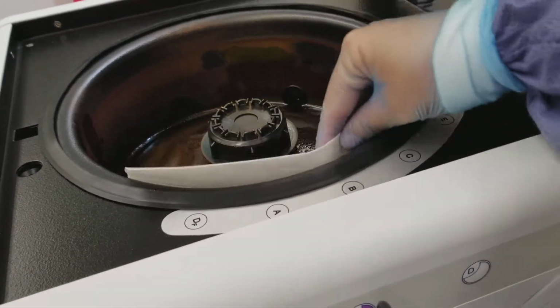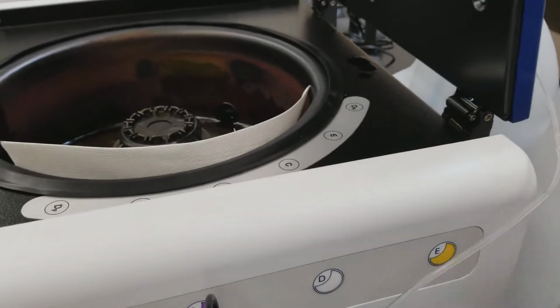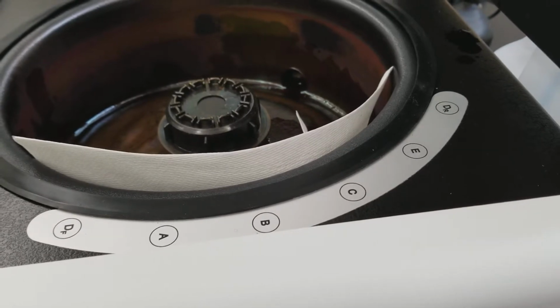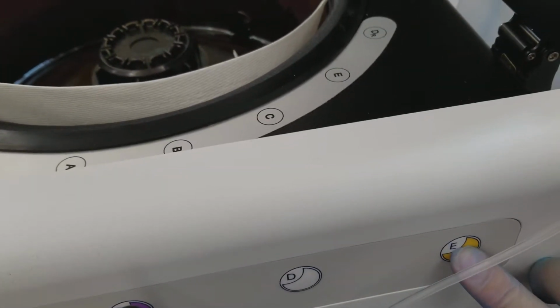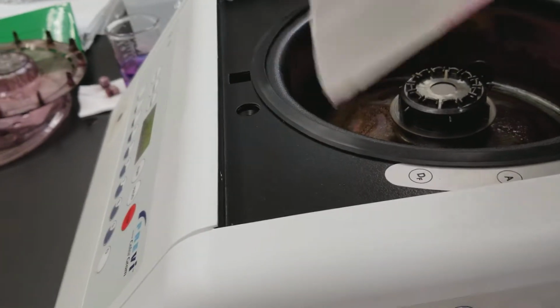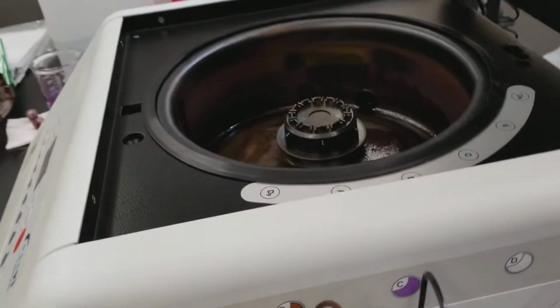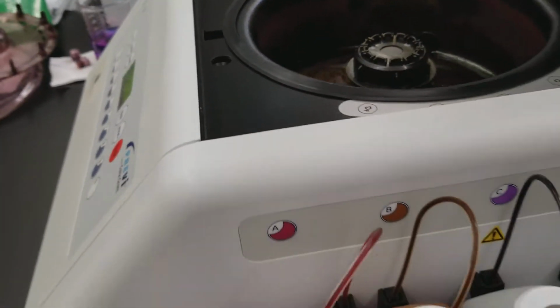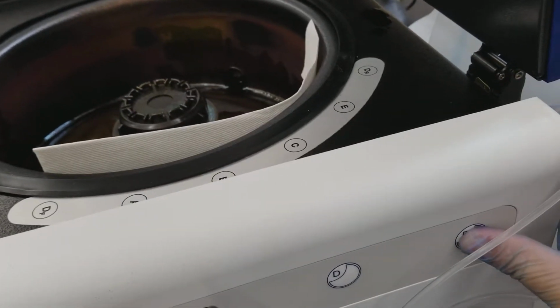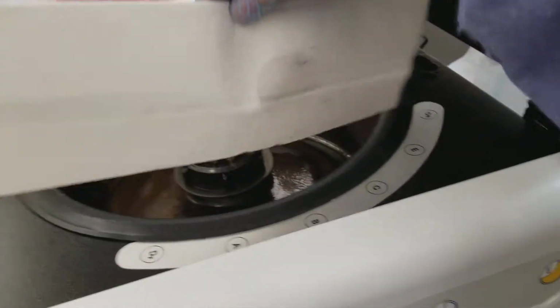And now let's test the ethanol. Okay, so the E is for ethanol, and it comes out over here. All right, so let's test that. All right, I heard it, and that's a pretty bad test because we just had the water, so you can't really tell. Hold on a second. Let me get another paper towel. All right, we're going to try that again. Okay, ethanol. All right, and we know it's going to be over here. So let's look where my thumb is.